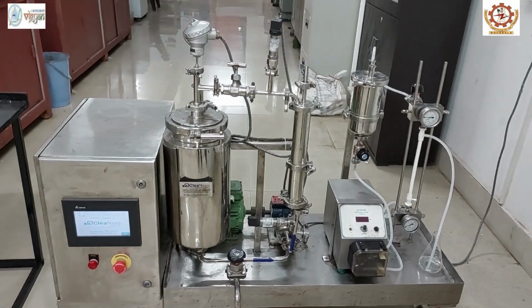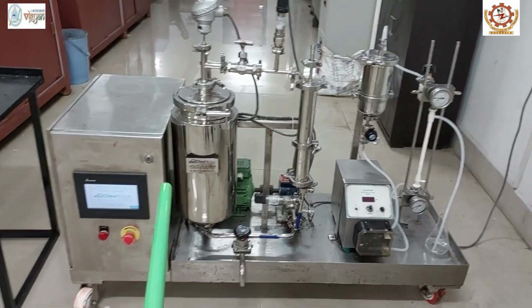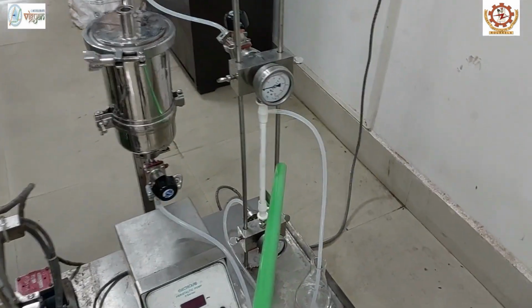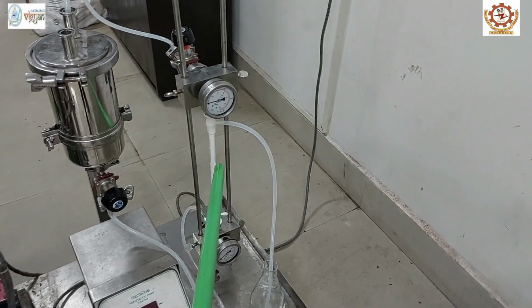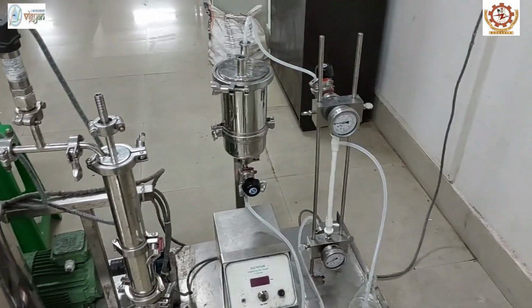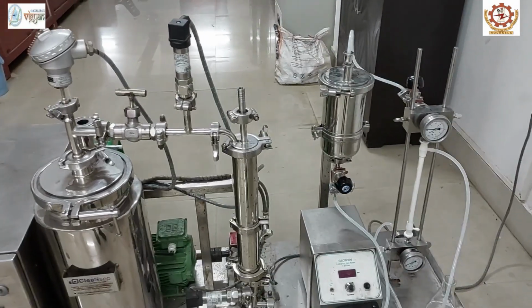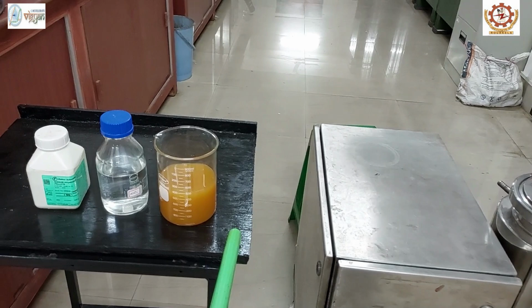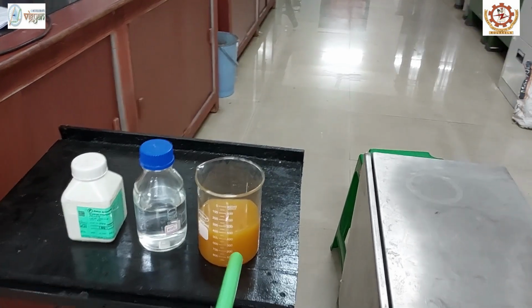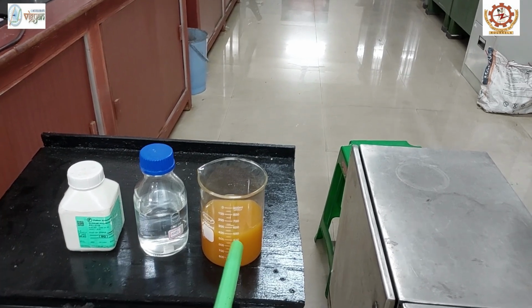The requisites for today's demonstration are a membrane filtration system. What you are seeing here is a membrane filtration system, and the next one is a membrane. What you are seeing here is a 0.2 micrometer microfiltration membrane, which is made up of polysulfone material. And the next requisite is fruit juice. Here we have taken mango juice. You can see this mango juice is turbid and unclear.